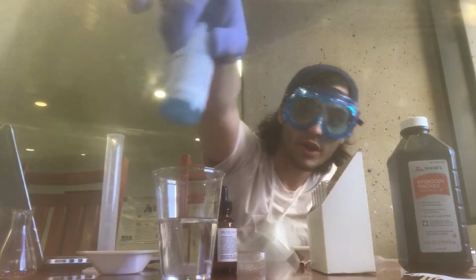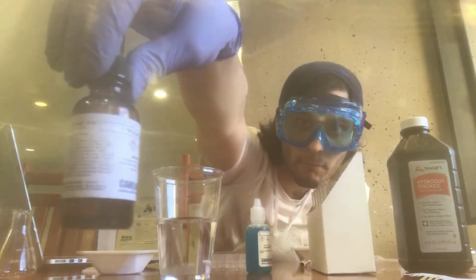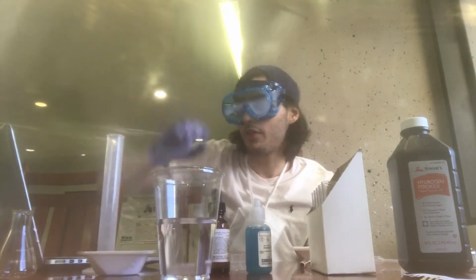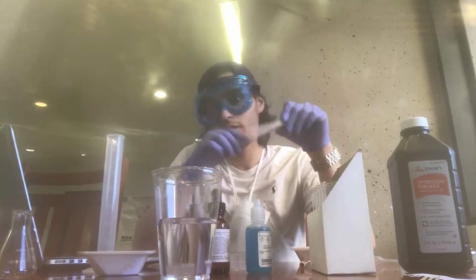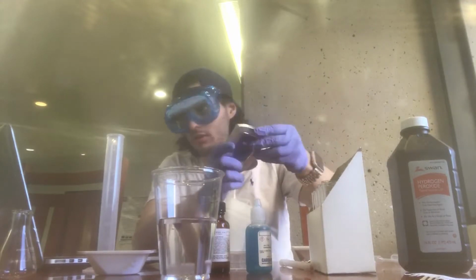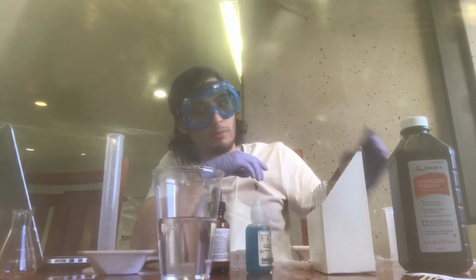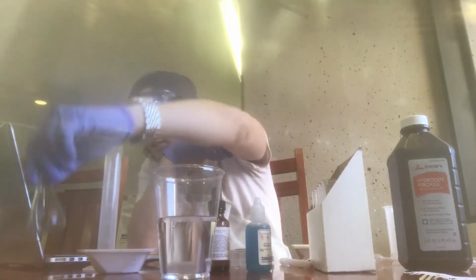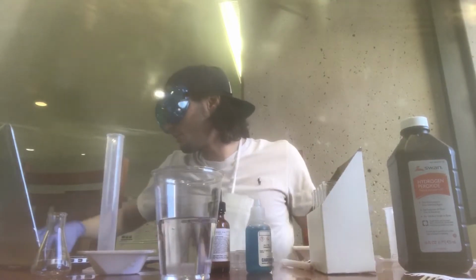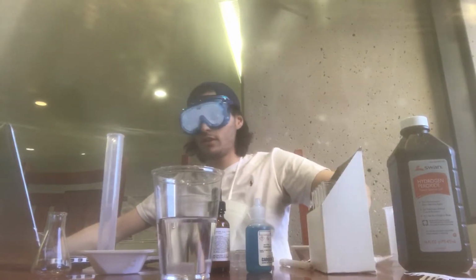The items that are needed in this experiment: let's start with the first one, which is the copper chloride solution, right here. We also have the silver nitrate solution, a weigh boat, the thermometer, which is right over here, the mini pocket scale, a 250 ml beaker, a 25 ml flask, a plastic spoon, which is right here, another plastic spoon, and a pipette.